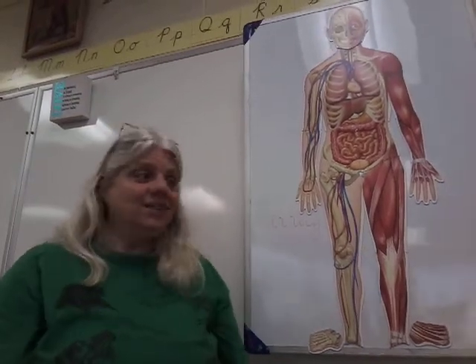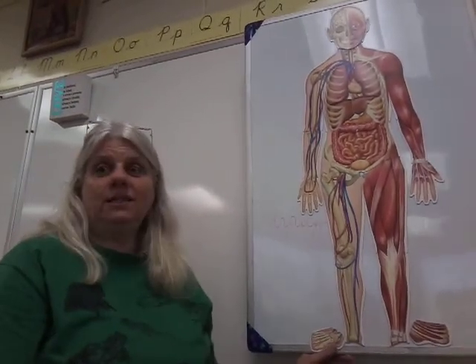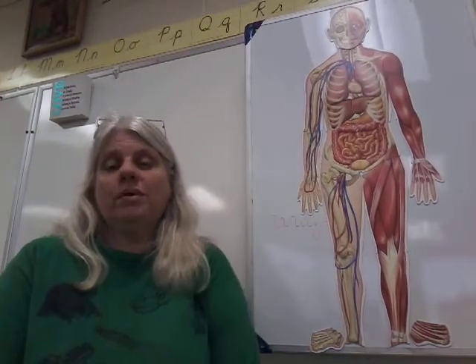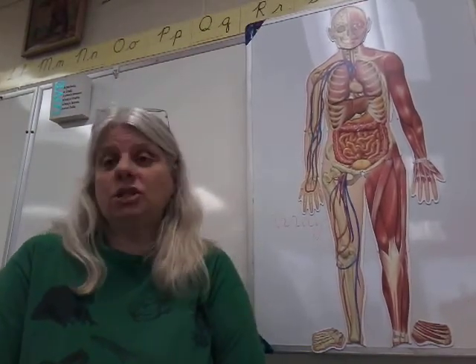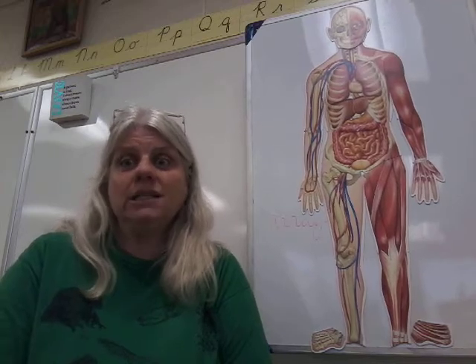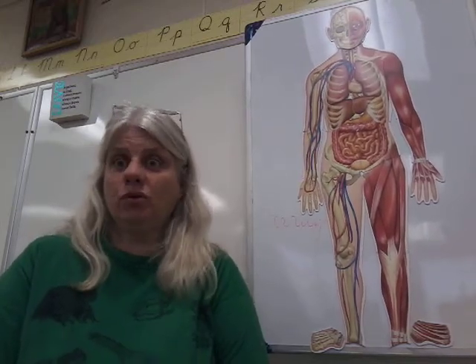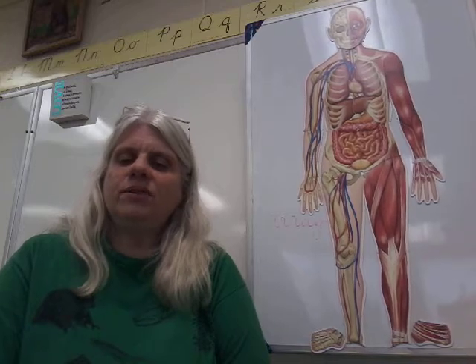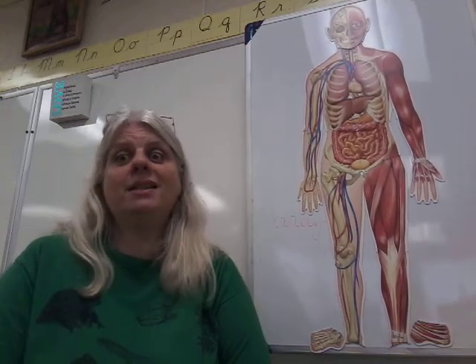Welcome back. Today is your last video in science. Please look at the microscope videos that I have attached here, with the different cells under a microscope, and observe those things. I hope you enjoyed all of the videos about the paramecium and the amoeba.